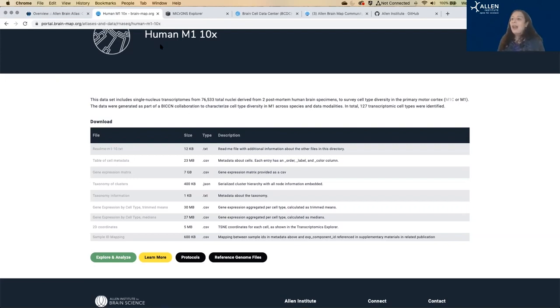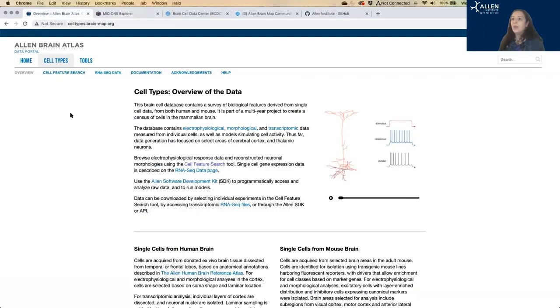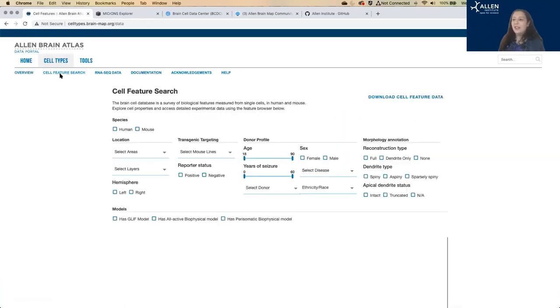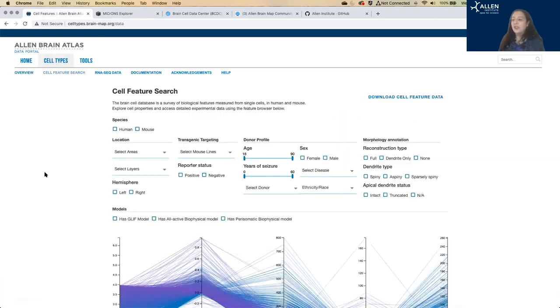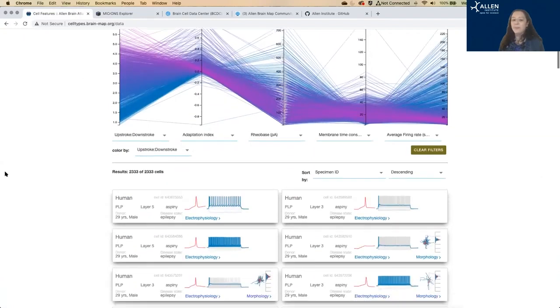So that is what I'm going to cover on the transcriptomics data. So I'm going back to our cell types homepage. This is where I got to by clicking that circle on the landing page back home. And I'm going to show you our electrophysiology and morphology data. That's our cell feature searches where most of that data lives.